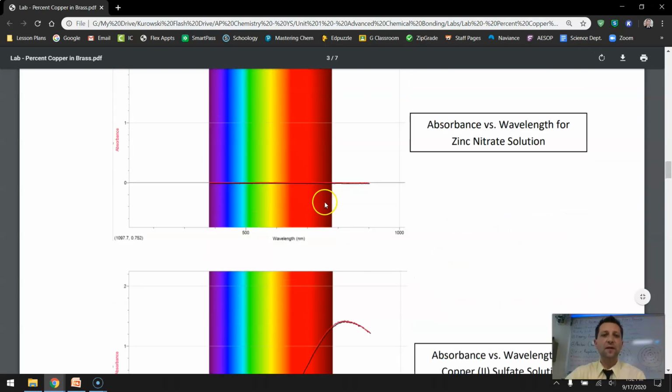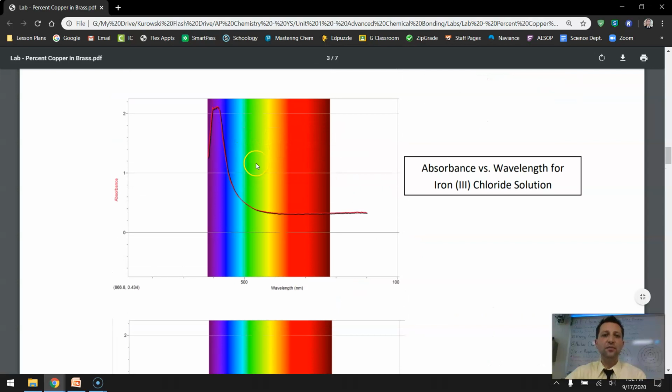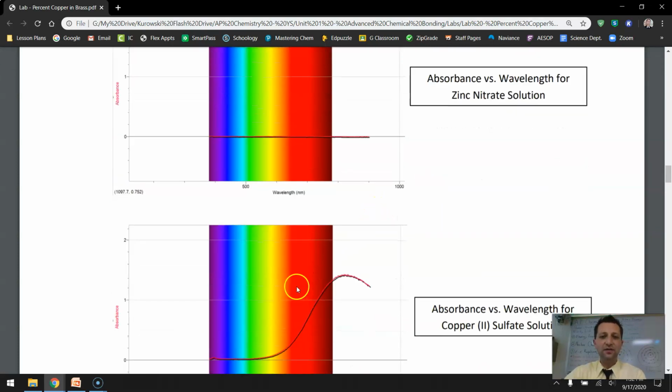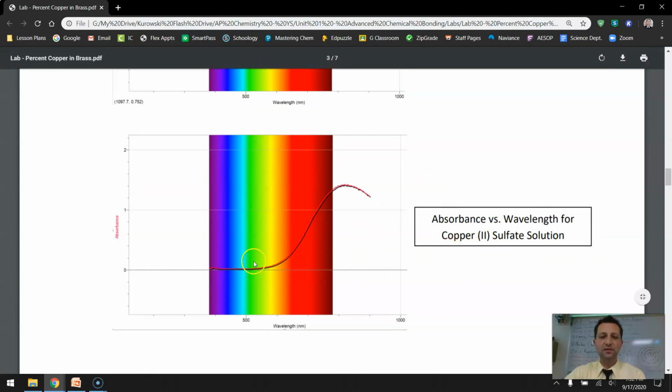Okay, so there are some questions in your post lab about how these would interfere, or whether they would or wouldn't. You want to pick the wavelength where the maximum absorbance is located for that particular substance. So it would make no sense for us to set our wavelength to 500 nanometers for the copper solutions we made, because at 500 nanometers it's zero absorbance.